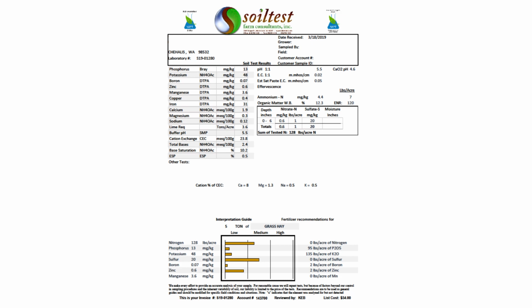I hope this explanation helps you to better understand your soil analysis results. We take a lot of effort to make sure that the results are accurate and timely, and that they can be used in a manner that will be beneficial to you and the crops that you're growing. If you ever have any questions regarding your soil test report, don't hesitate to call us at the office and talk to one of our soil scientists.